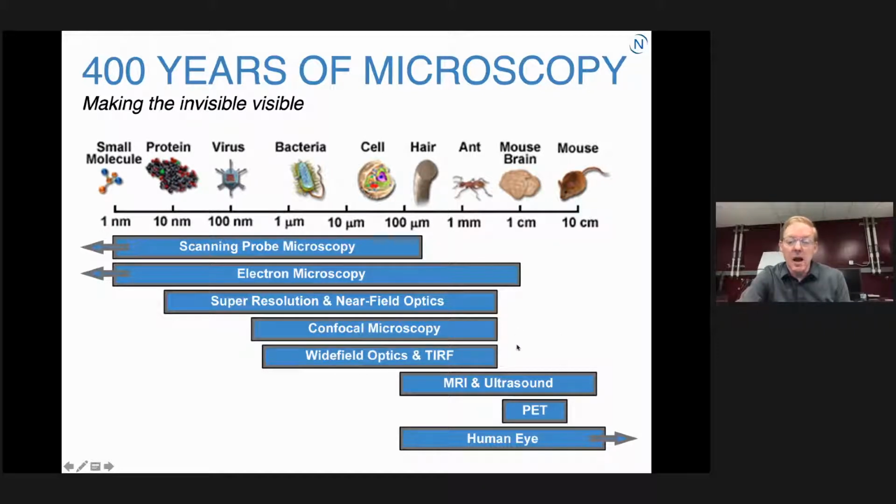We're going to be talking about optical microscopy, which is probably the most closely analogous to the sense of sight. We'll talk about electron microscopy, which is an extension of that by playing with the electromagnetic spectrum. And then we're going to hit on scanning probe microscopy. We'll talk about them very briefly here and then go into the labs and actually see what that looks like.